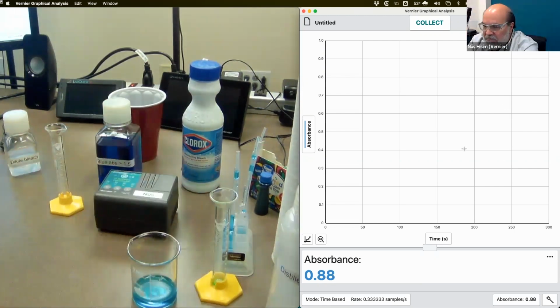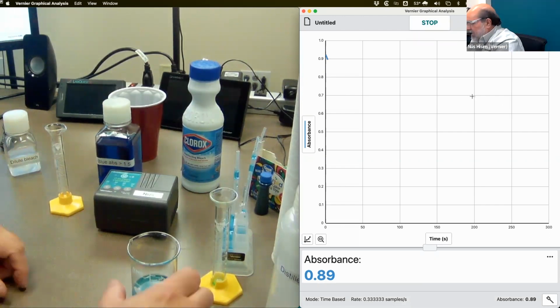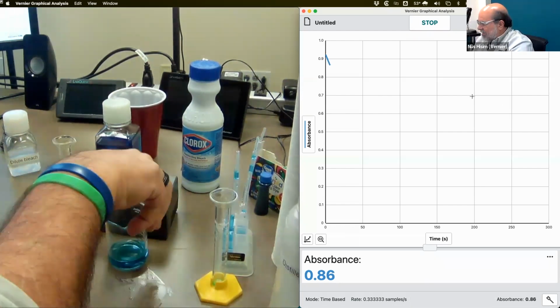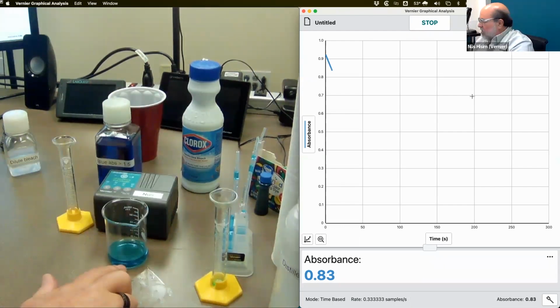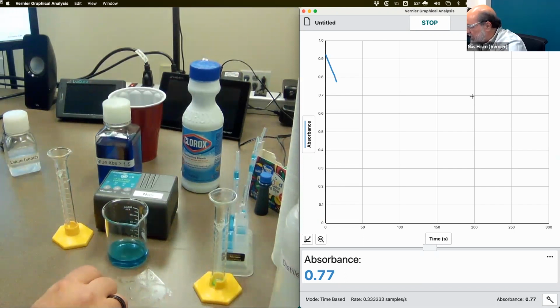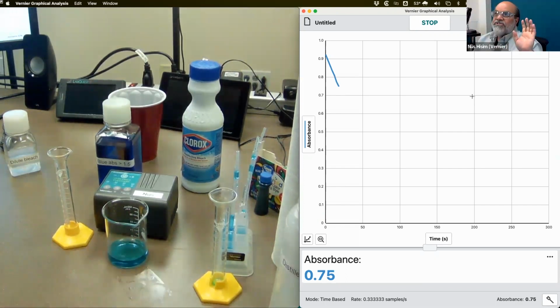And then I'm watching that meter. When it hits the max, I'm going to hit collect. And you should be getting data on your end. Now, what I like about this is we have a visual cue right here, right? The mixture is still happening here. You can see the data appearing on your screen. Hopefully, if you're collecting data with me, you're getting it. By the way, there is sample data in that folder.